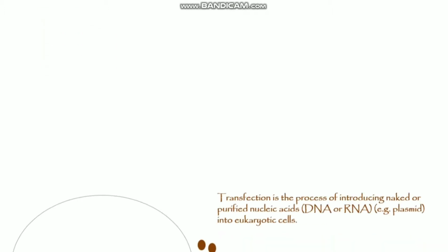In this tutorial video, I'm going to talk about transfection. Mainly, I will talk about the principle as well as all of the steps regarding transfection, and I'll discuss transient and stable transfection here. Let's begin.